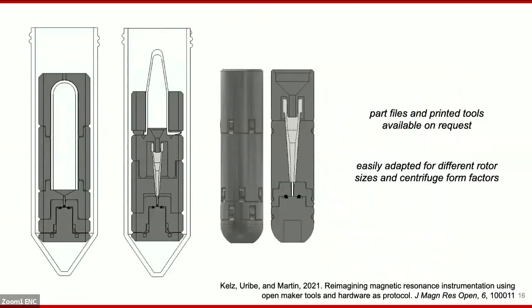Of course, the most exciting part for us is that these tools are accessible to, available for, and beneficial for any lab studying biomolecular solids with solid state NMR. And we want to embody this vision put forth in a recent review by Rachel Martin's group and echoed by many, many others in the NMR community, of sharing and developing tools for magnetic resonance experiments in an open and collaborative way. So that means if you have a 3D printer and you want to print these, we're happy to share part files with you.